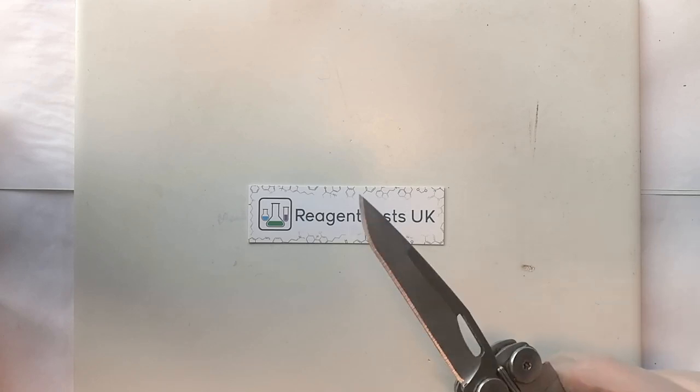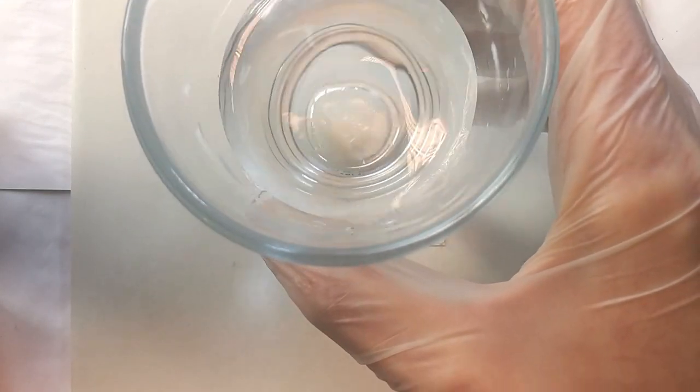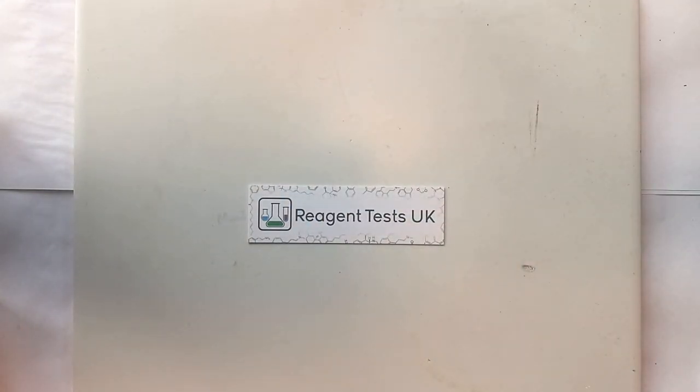You'll need a knife, a sharp knife to scrape your sample with. And you'll also need a beaker of water handy to put any waste into. The reagents, while certainly hazardous, are significantly neutralised by putting into water.